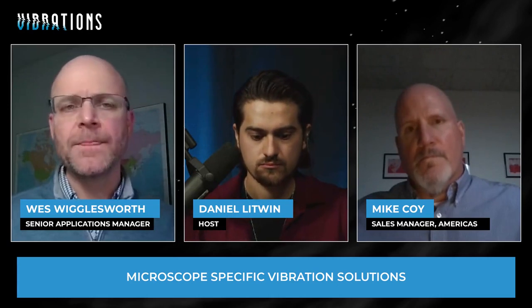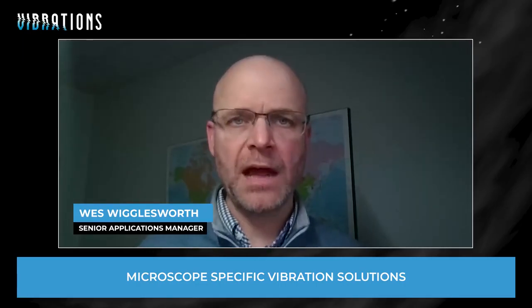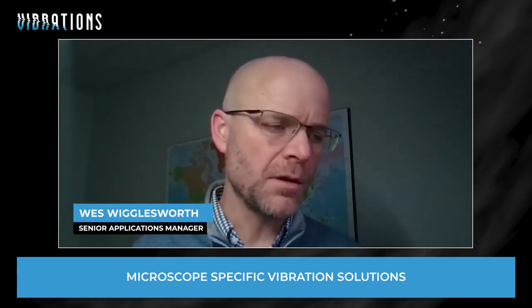as time goes on or at different times of the day, and the use of this microscope is over long periods of the day, you want to account for all of these scenarios without thinking about it at a later time or dealing with it at a later time, because it can be very impactful to shut down the microscope and reinstall it after the vibration platform is installed. So yeah, that's a very important issue that we deal with a lot.